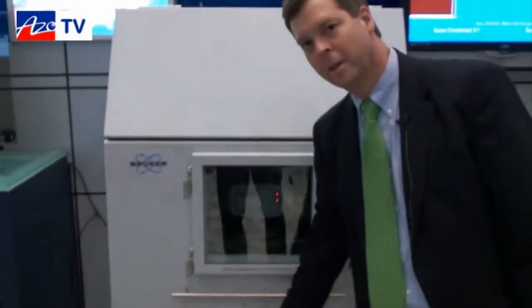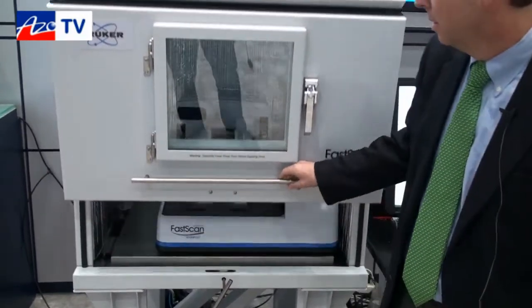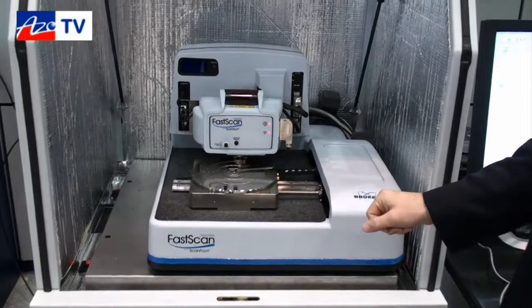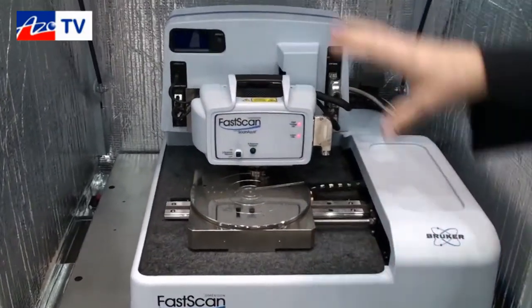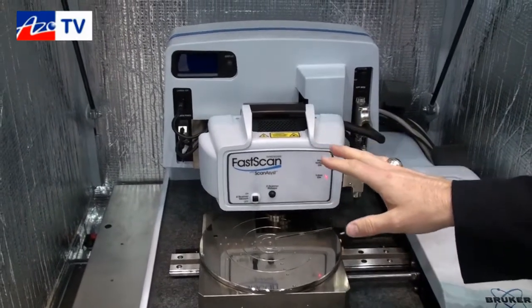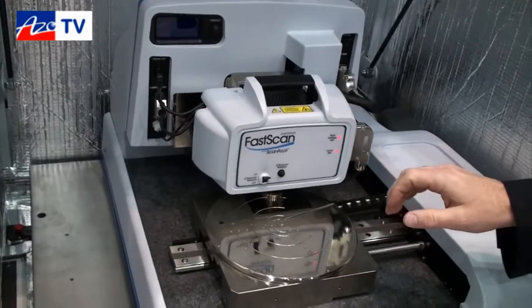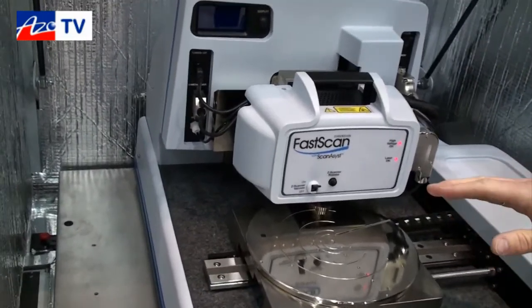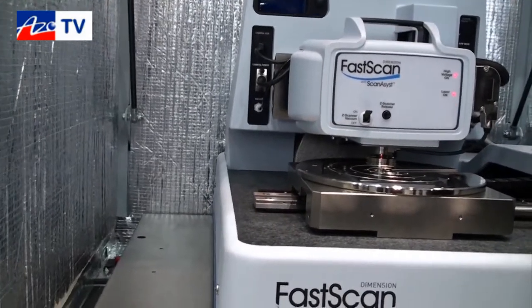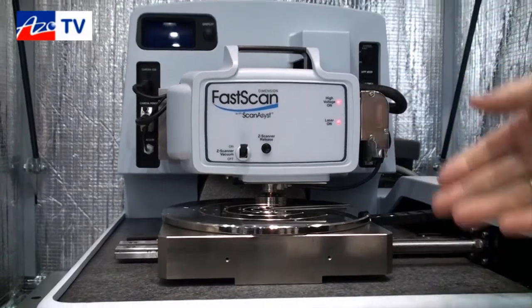This is the Dimension FastScan. I'm going to open it up here. It's an acoustic chamber to keep it quiet inside. This is the Dimension Icon platform, Dimension FastScan scanner. It has X, Y, Z scanning ability to go up to 20 times faster than normal scanning. You can go up to 100 times faster as well, so it's a very fast scanner.